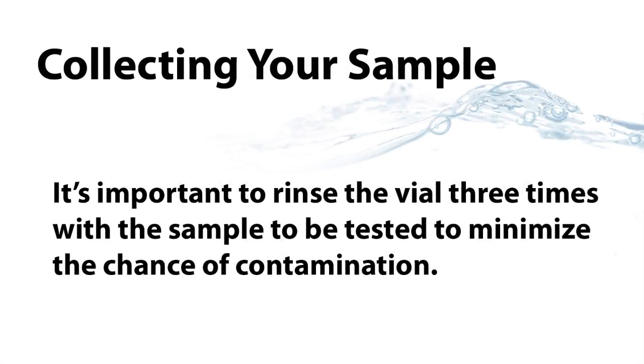Before adding your sample to the vial, it's important to rinse the vial three times with the sample to be tested. This minimizes the chance of contamination from a previous test.